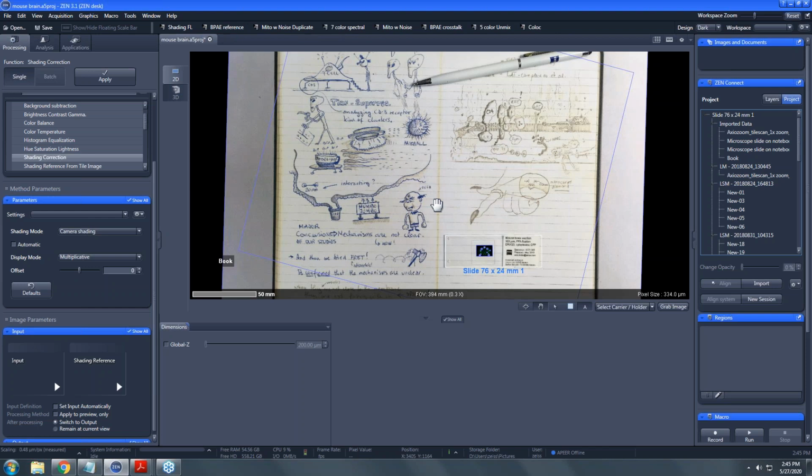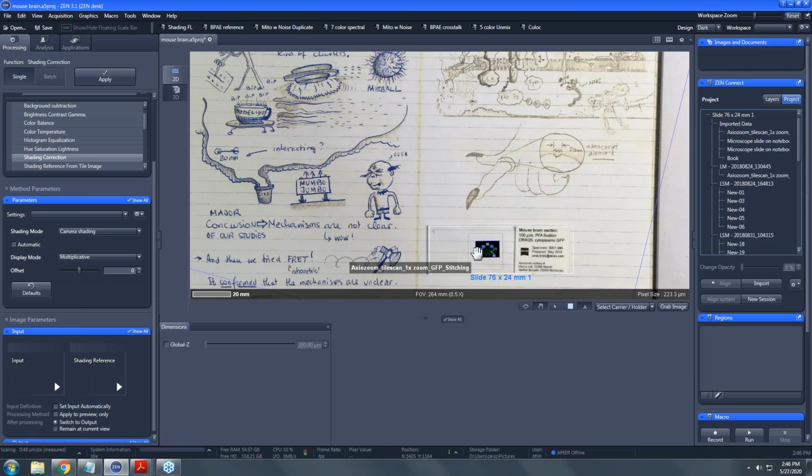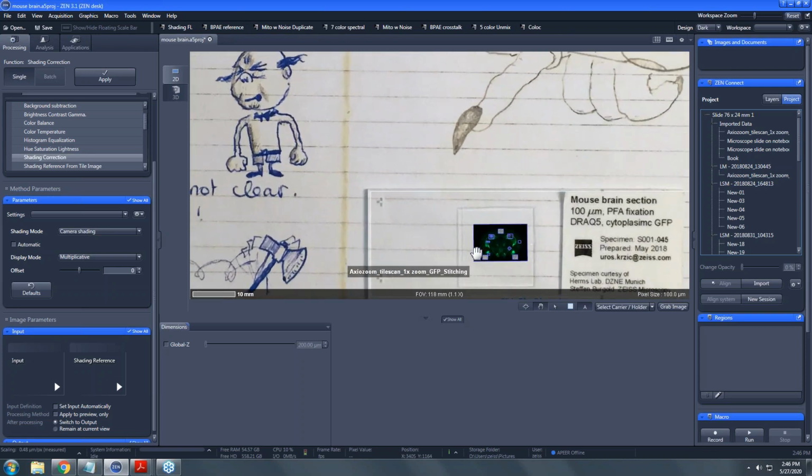And quite often somebody wants to take image data from an electron microscope, for example, and use it with an optical microscope. It's the same sample. And traditionally you would just put the two figures side by side. But it can be really impactful if you can actually correlate these images so that they become different channels of the same image. That's what Connect comes out of.